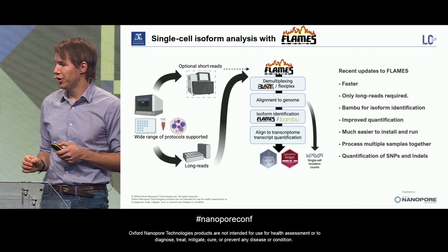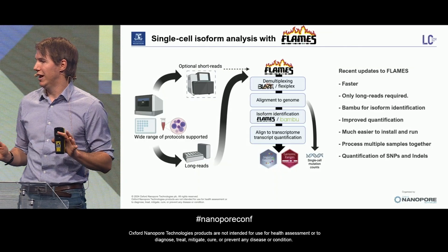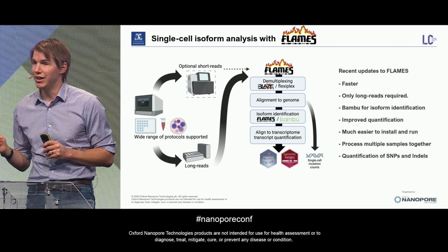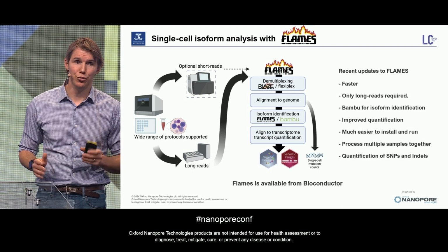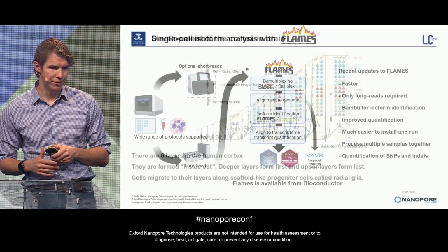FLAMES has been undergoing ongoing updates and development work. Suffice to say that over the last couple of years, it's become faster, more accurate, and easier to use. It's available on Bioconductor, so if you want, download it, give it a whirl, and let us know any feedback.